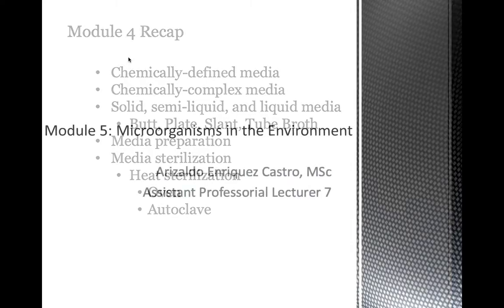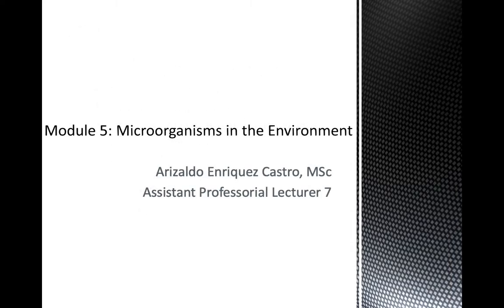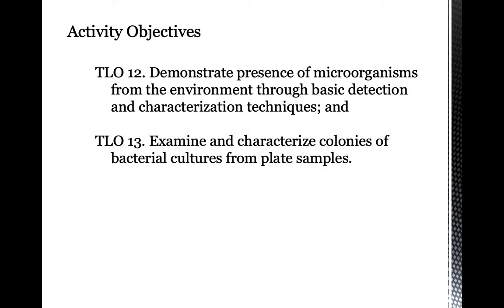We'll begin our discussion now with module number 5, the microorganisms in the environment. At the end of this activity, you, the students, the performers of the virtual simulation, are expected to first demonstrate the presence of microbes from the environment through basic detection and characterization techniques. Essentially, appreciate how it is done.